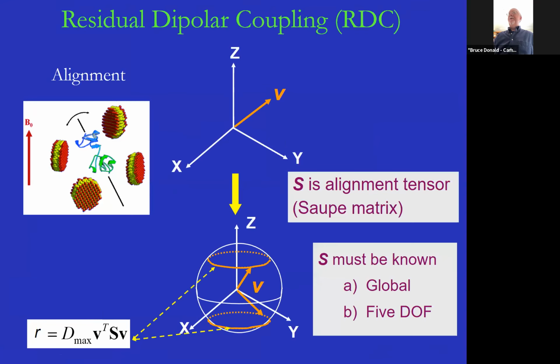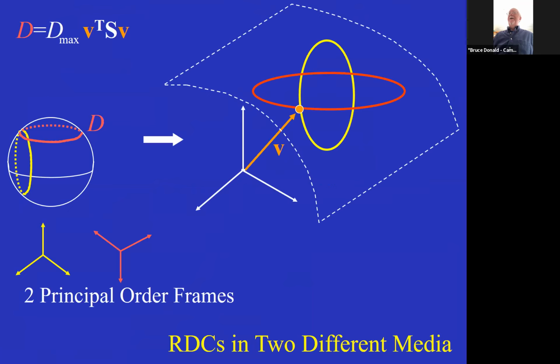That one's actually much easier to argue because everything's globally referenced. So we'll have 8 possible solutions, right? If we use that to resolve the amide bond vector in residue I, and then in residue I+2, that's solved completely independently. It doesn't use any information at all from other residues. So you're just fixing them and you're finding kinematic solutions between them. So there's no problem. In the case of 2 different order frames to pin down amide bond vectors, there's actually no information propagated between the residues at all.